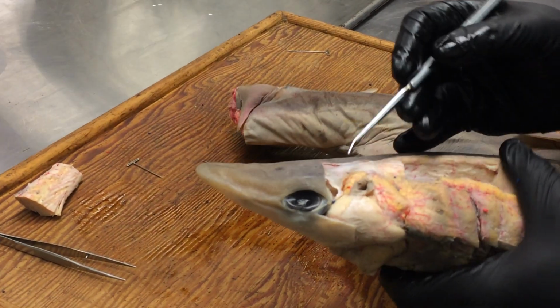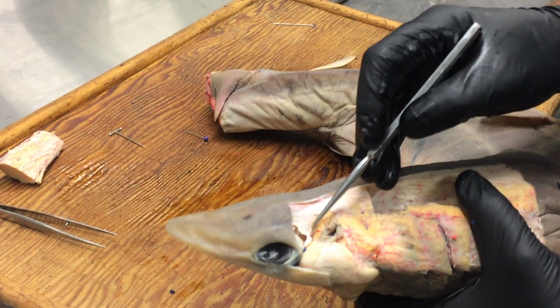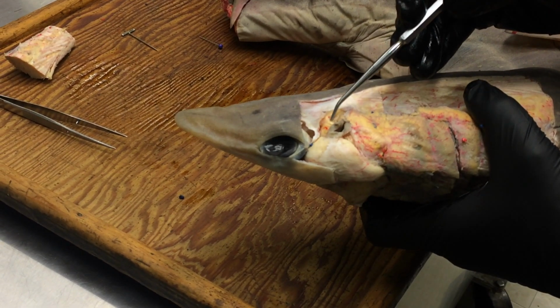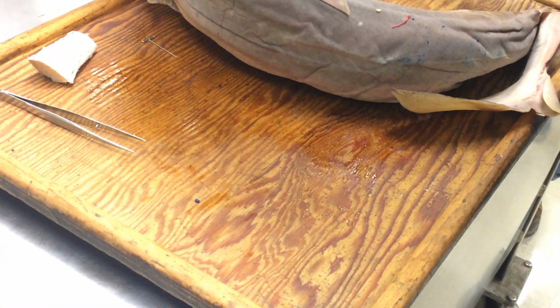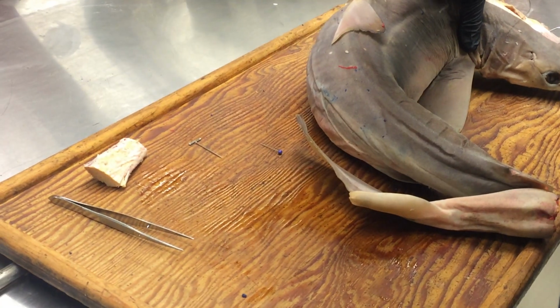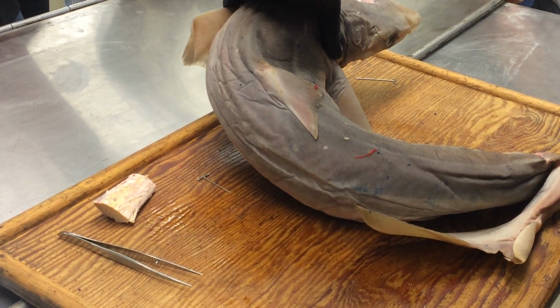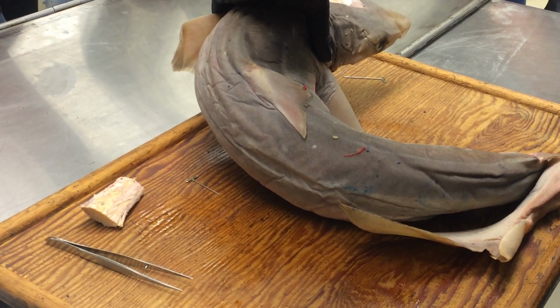Okay. And then there's a couple of muscles that lie right in front of the spiracle, and there's one of them that's a pretty good-sized muscle that's running from the chondrocranium down to the palatal quadrate that lifts the palatal quadrate up, this guy here. And that would be called, this one right here. You see that okay? So it's lifting up the palatal quadrate, so we would call it the levator palatal quadrati. Okay, because it lifts up the palatal quadrate.